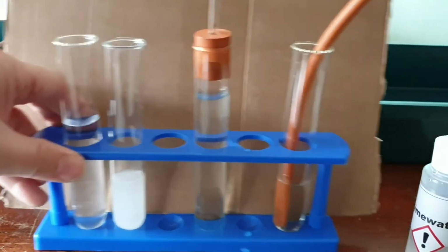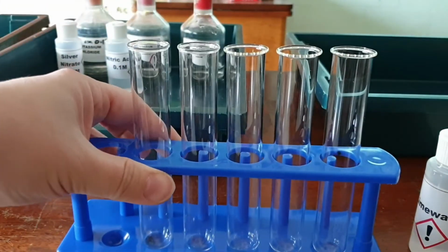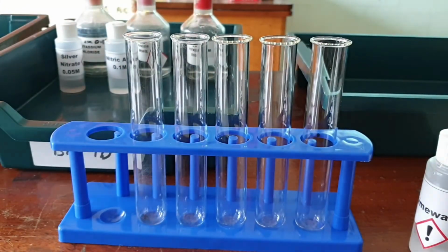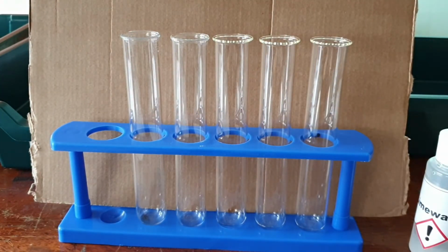Okay, let's move this out of the way. Right. We're going to look at halide tests now. So, halide tests.